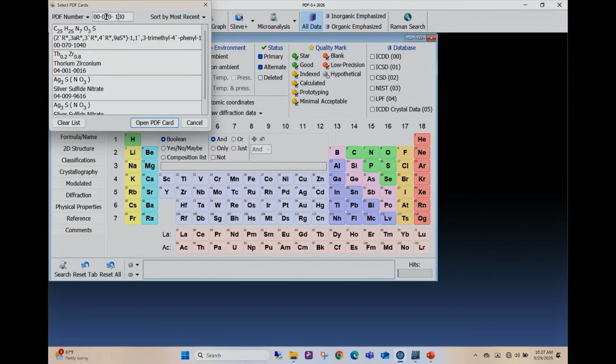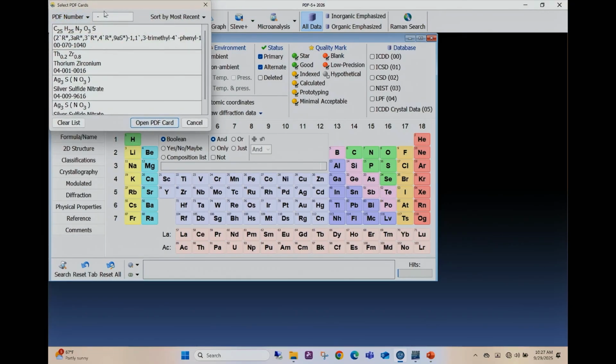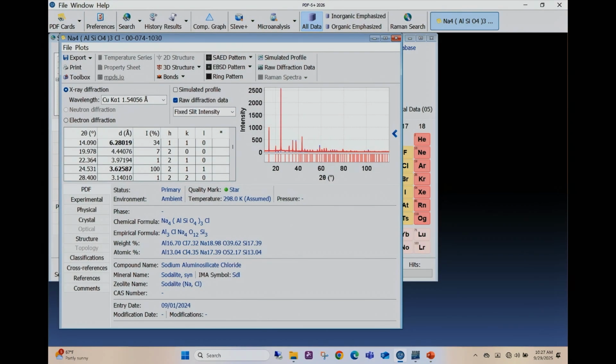And 1030, 030. Okay. Telling me that I pay attention to what I'm doing here. Oh, 0741030. Yay! Okay. Sorry about that, folks.